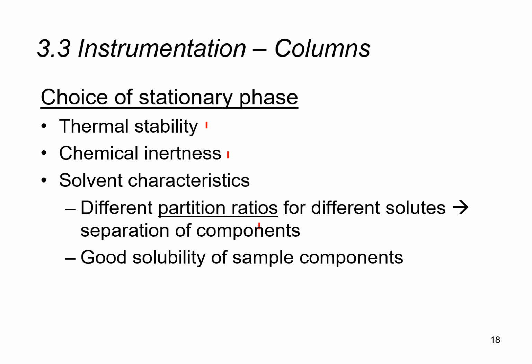Of course, that will certainly lead to disaster. So therefore, we do not want that to happen. So our columns, especially the insides of the columns, must be chemically inert. They must not react with anything that flows through the column.